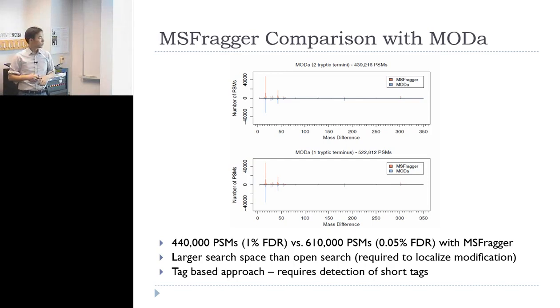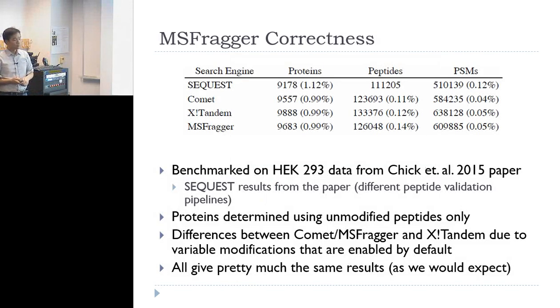So when it's going to build the index based on the parameters that you specify in your config file, probably the mass tolerance. So I think 500 Daltons in the example you had. So that's actually specified at search time. So the index is only dependent on your protein database and your digestion parameters, and obviously all of the variable modifications that you want to specify. But after that's done, the index is the same. So it uses the same index for a 500 Dalton search or a 5 ppm search.